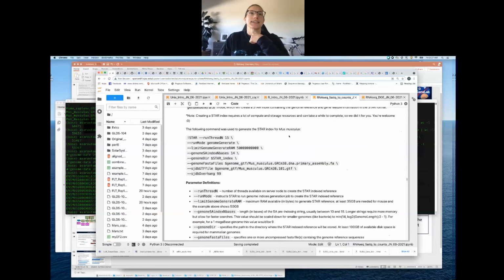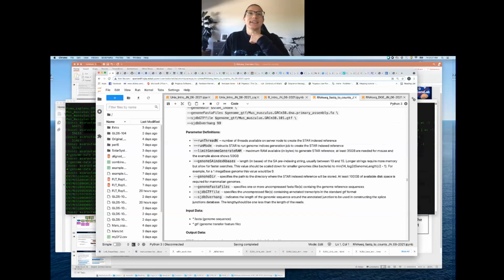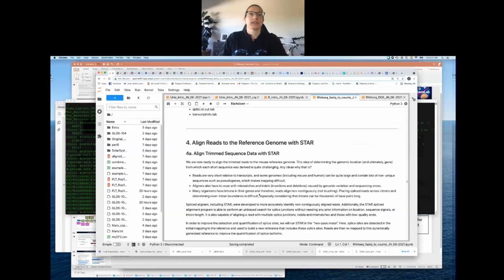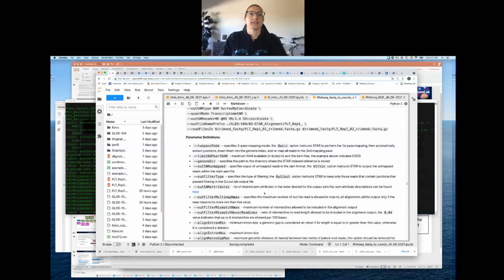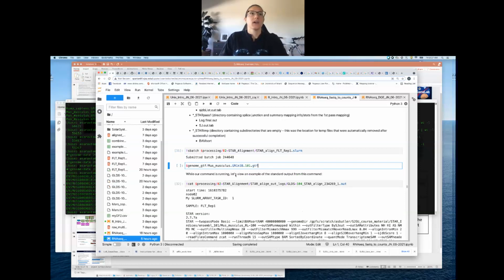Scrolling up to the GTF file. Can we take a look at it? It's okay, we can look at it again. So when you look at the total number of lines in your GTF file, which I know we looked at somewhere, but I can't seem to find it.